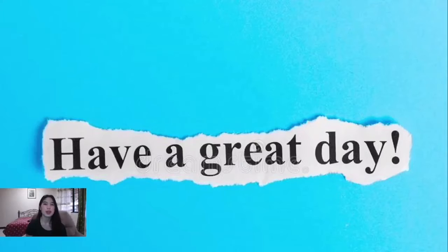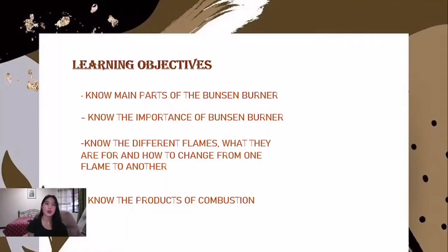So now, we're gonna tackle one of the parts of the laboratory apparatuses, which is the Bunsen burner. The learning objective is to know the main parts of the Bunsen burner, to know the importance of the Bunsen burner, to know the different flames, what they are for and how to change from one flame to another, and to know the products of combustion.